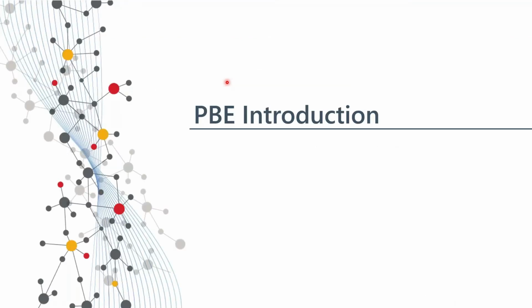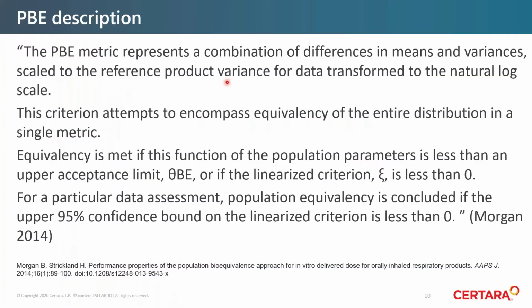Now we are going to focus on the PBE. PBE, first of all, the introduction. So you have a very nice paper which was published in 2014 by Morgan. This is the reference which is here.